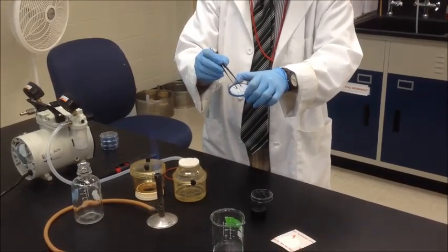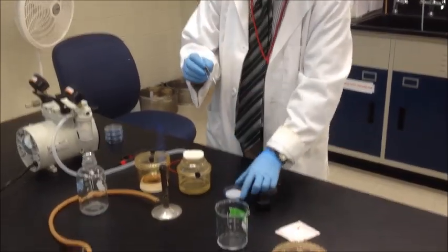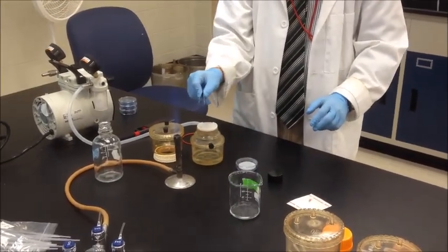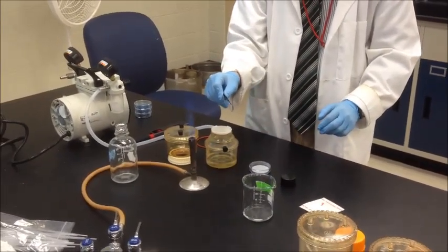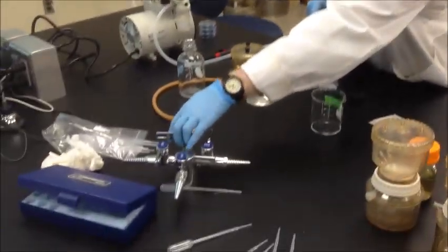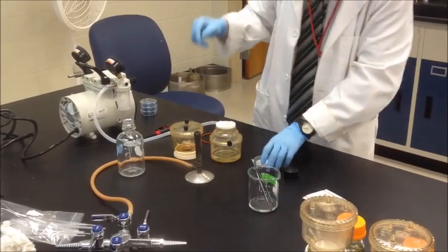Just press gently down, close the plate, flame your forceps, you can turn off the Bunsen burner, put this back in, and then label the plate and put it into the incubator at 45 degrees.